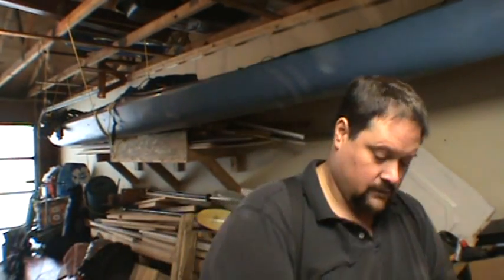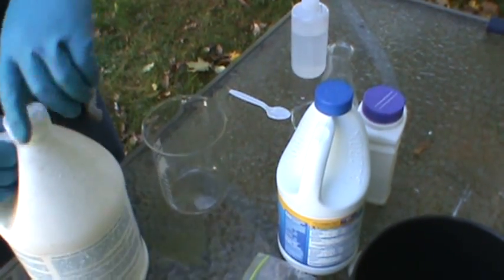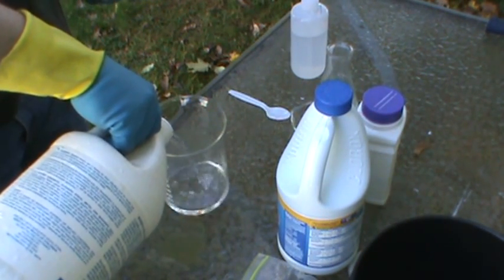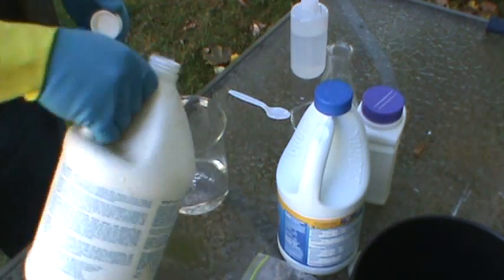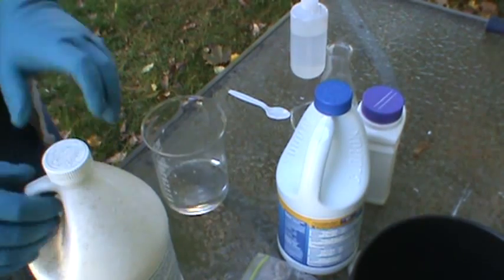First off, you're going to start off with a very small amount of hydrochloric acid. The solution can hold a lot of gold in it, so you don't need to use a whole lot. We're going to start by adding some hydrochloric — it's about 150 milliliters. Again, you don't need very much; this stuff will take a lot of gold in solution.